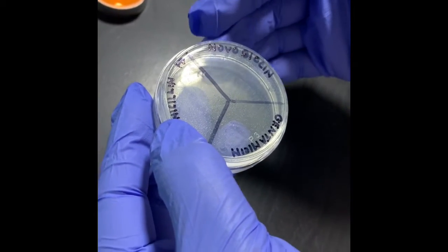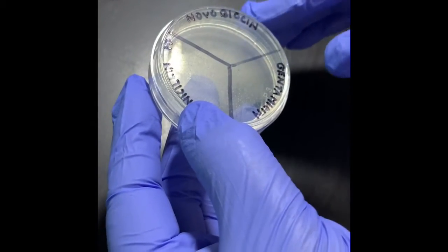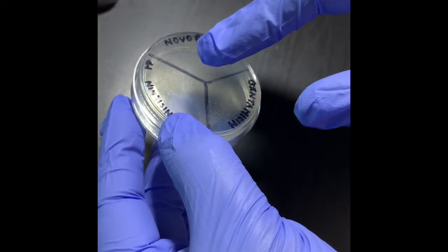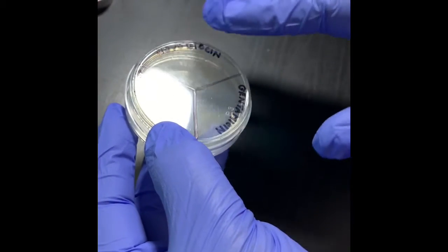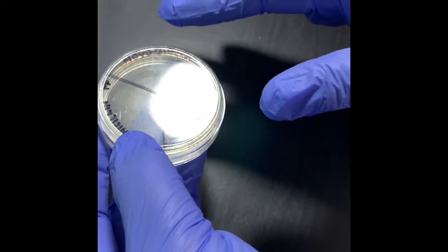Whatever you mark, like your initials and date, remember that all the markings should be at the edge so that we can see from the top after all the reactions happen with the bacteria and the antibiotic.